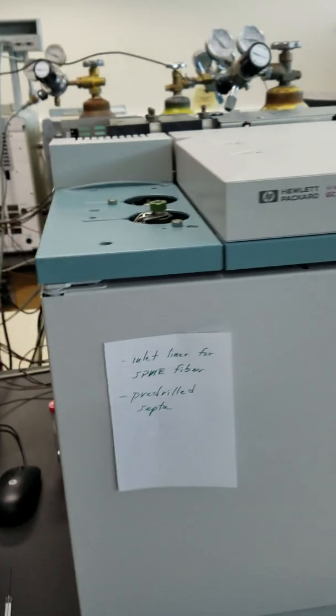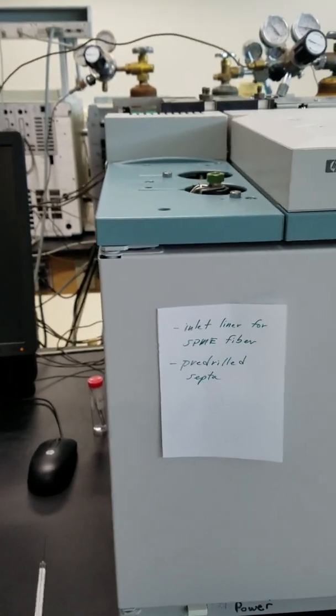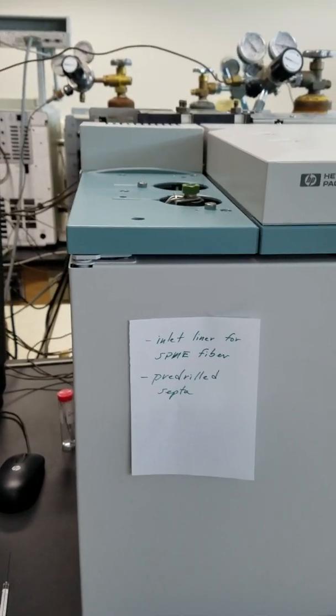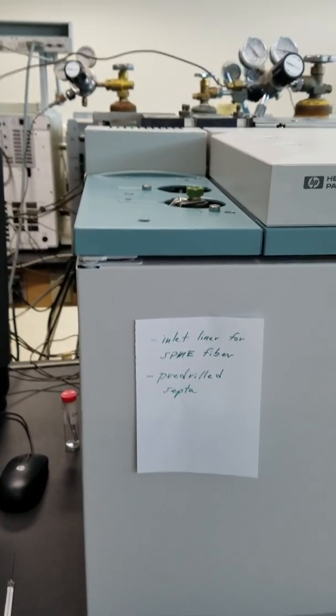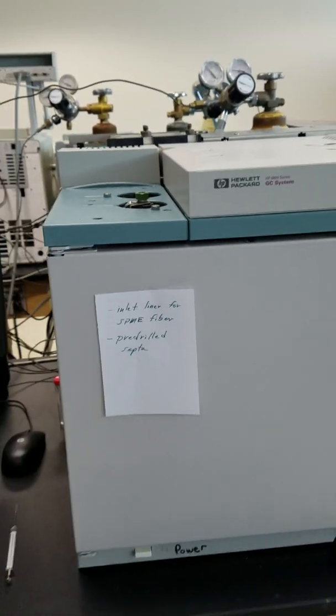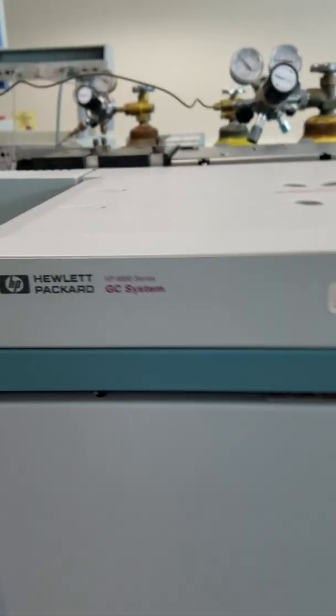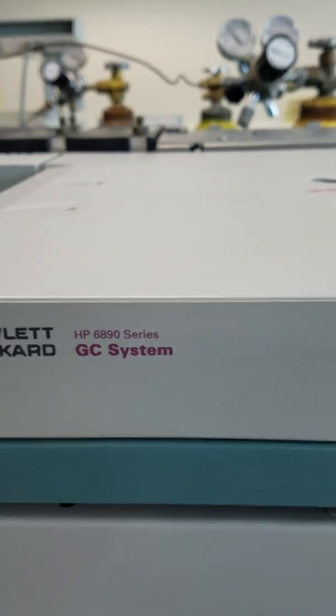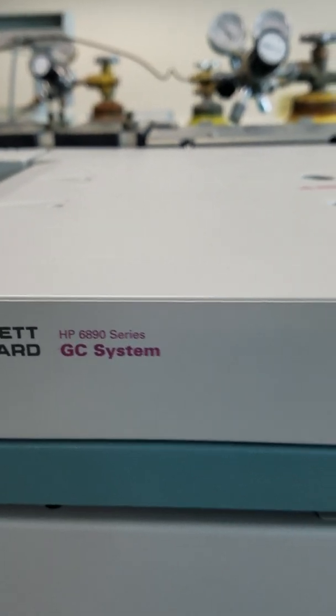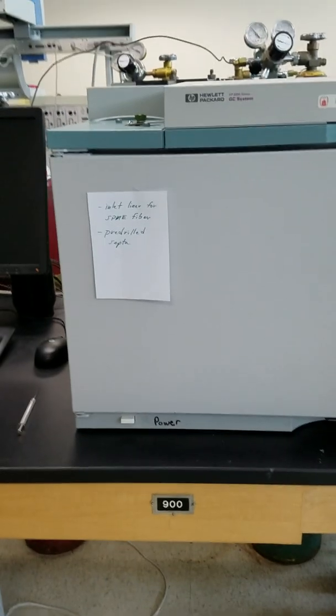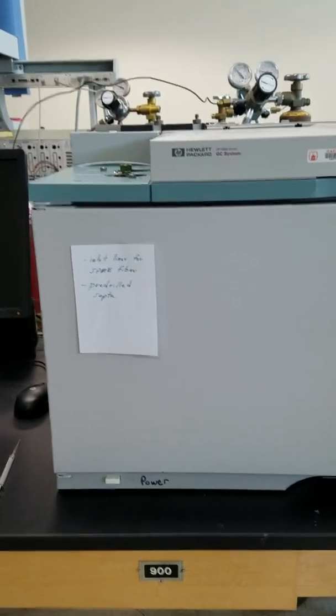Okay, this is for CHEM 480 and I'm going to talk about GC gas chromatography. Here is a GC. This is a Hewlett Packard 6890 series. These were really popular, especially like 10 to 20 years ago.